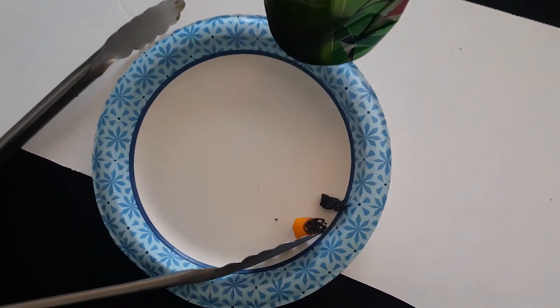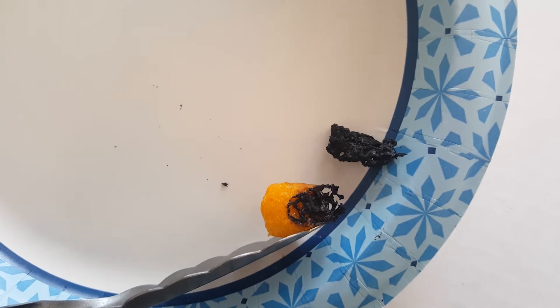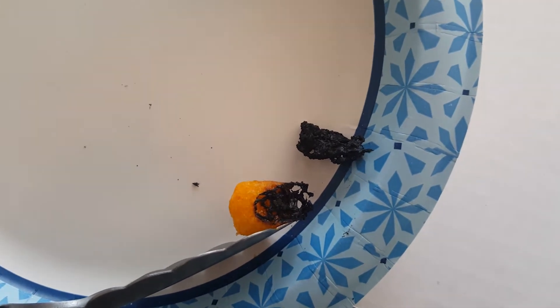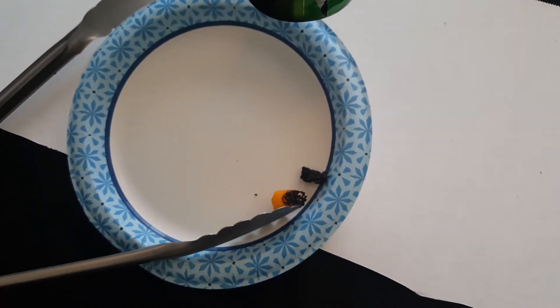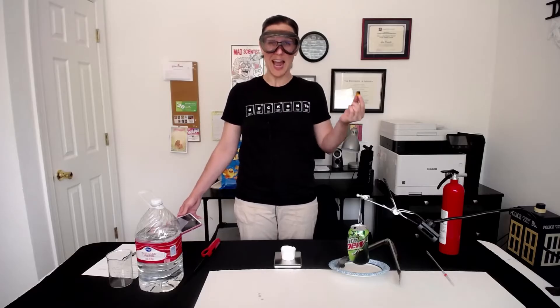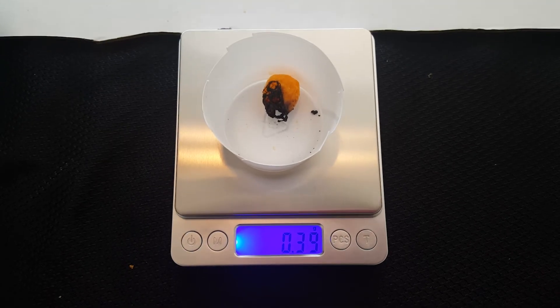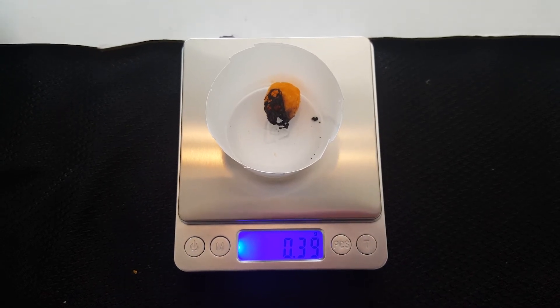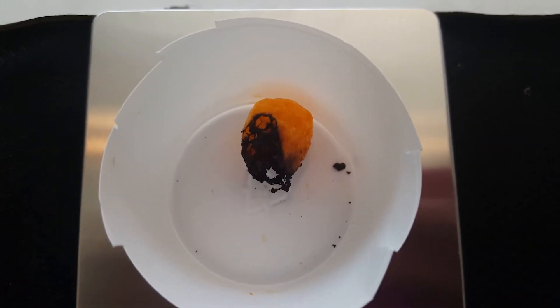It's also important to note that the entire cheese puff didn't burn here. I still have some cheese puff left over that did not ignite and did not contribute to the heating up of the water in the can, so that definitely poses some error. Let's take the final mass of the piece of the cheese puff that didn't burn so we can subtract that out from the initial mass — that's about 0.39 grams, give or take, because a piece of it did burn.